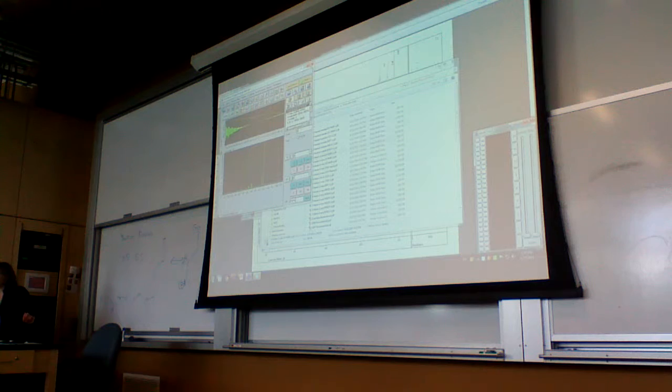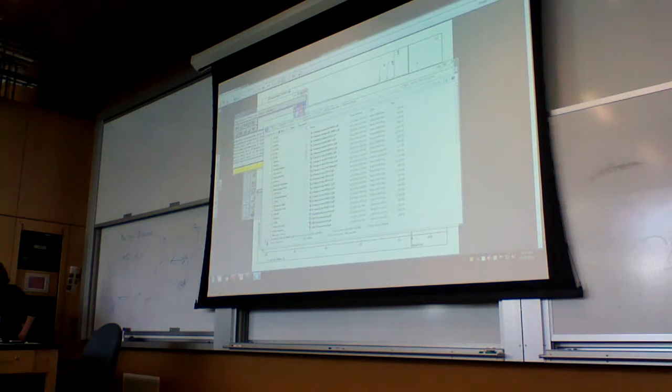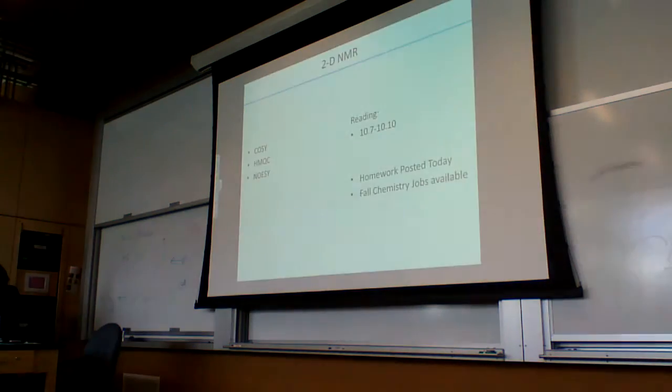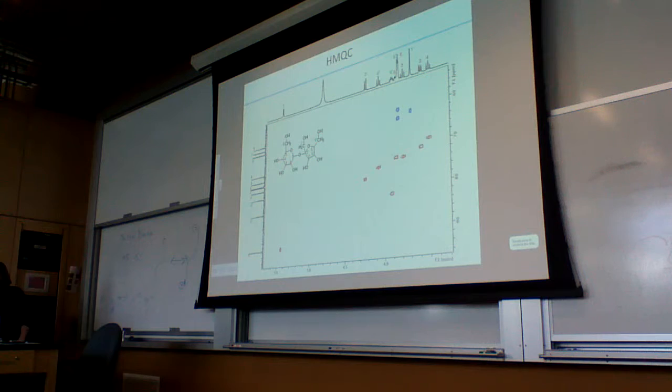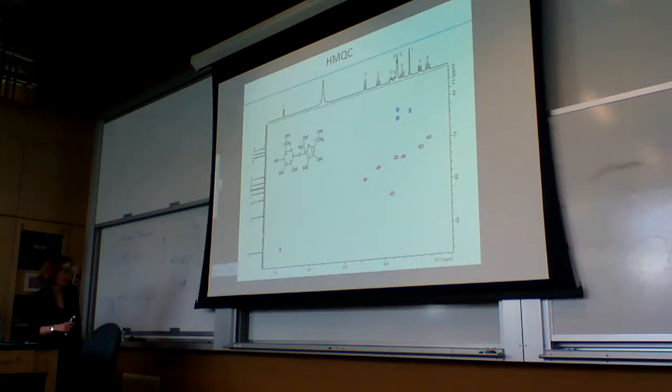They give you this similar information. It's just multiple bonds, or single bonds. So HMQC is our other example. Let's close that out before it dumps me out completely. If you did the print off from 2 days ago or for today, you would have the spectrum. What are we looking at in HMQC?